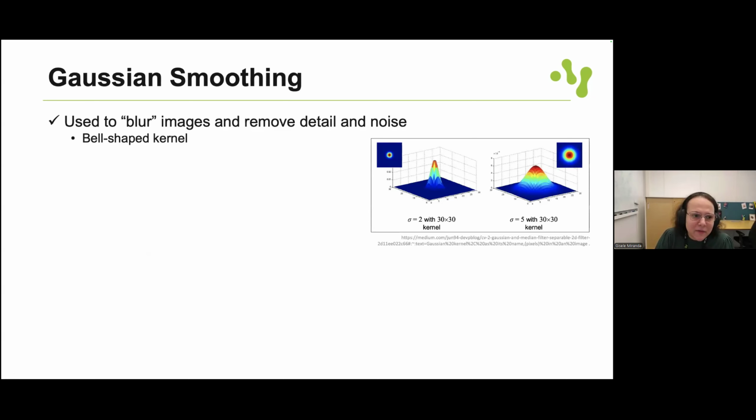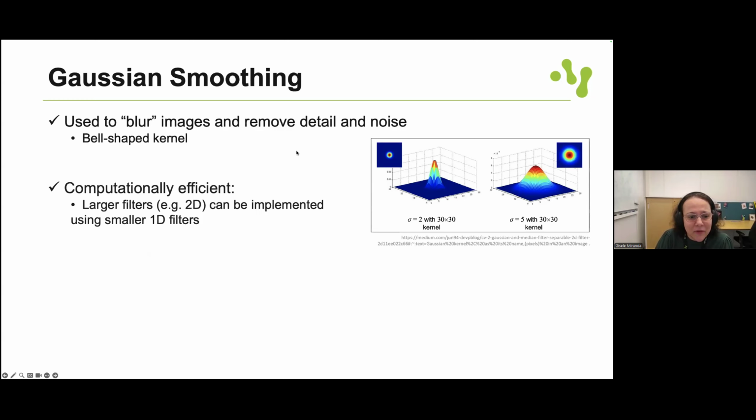And finally, I want to bring the Gaussian one as well. It's very common and very much used. This is an example to blur images and, as I mentioned, make the pixel distribution smoother for a specific region. The kernel here is Gaussian, of course, but you can also control the size of this kernel with the standard deviation.